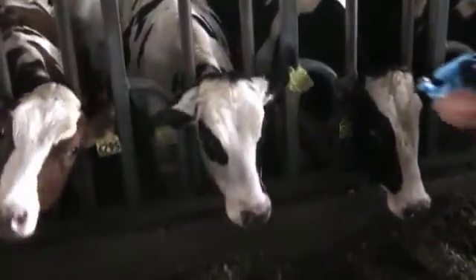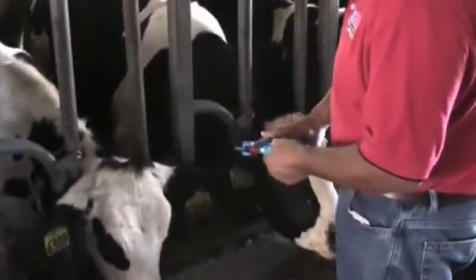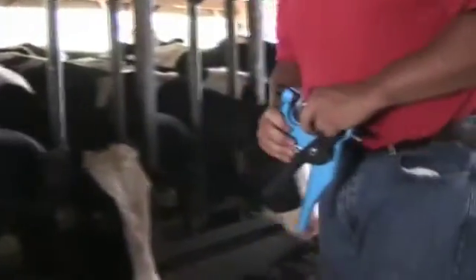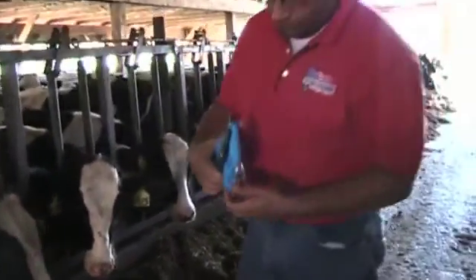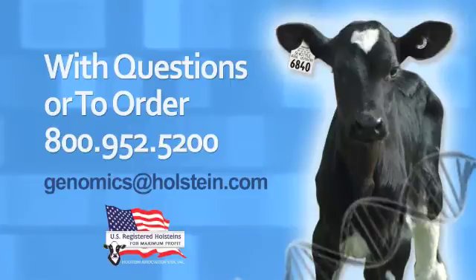Finally, we will show one more example of collecting a sample from an older animal in headlocks. As we have demonstrated, the tissue sampling unit provides a safe and efficient alternative to pulling hair or drawing blood to collect DNA for genomic and other genetic tests. With questions or to order tissue sampling units or Holstein Association USA genetic testing services, please call 800-952-5200 or email genomics at holstein.com.